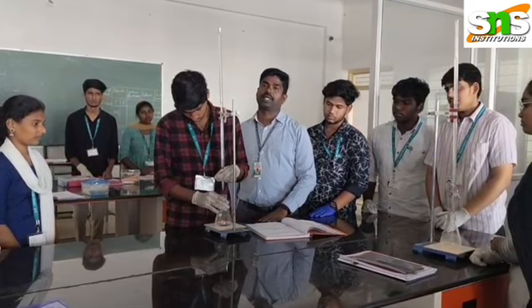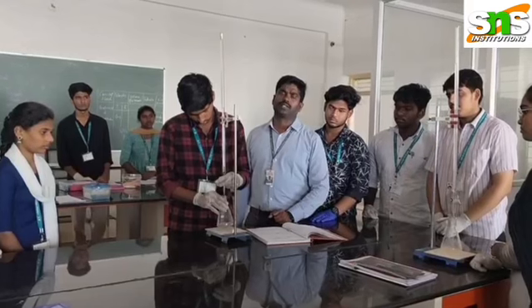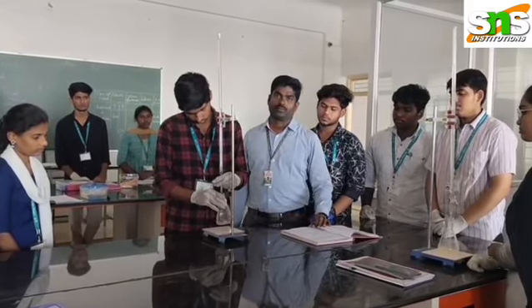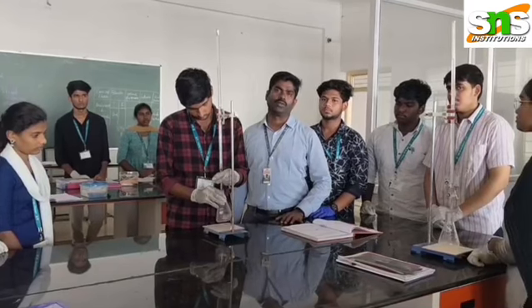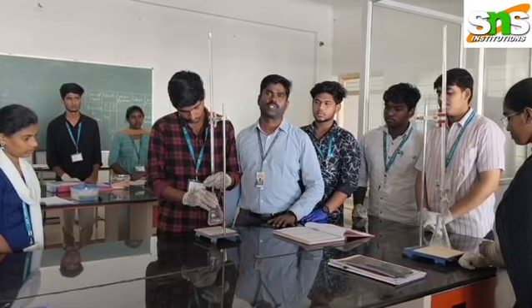This is the right setup for the titration. Those who are new learners need to follow this procedure. If you have any doubt about the selection of titrant or titrate, you can mail me or leave your queries, requests or questions in the comments.